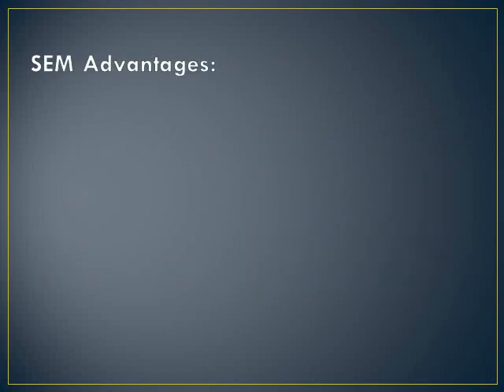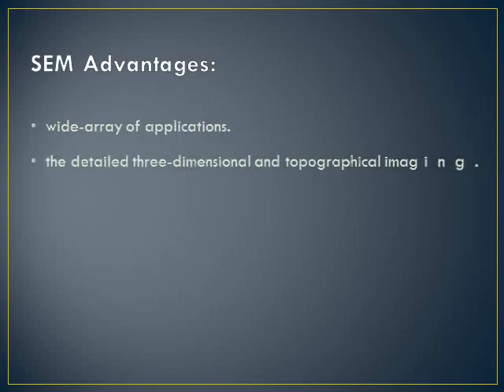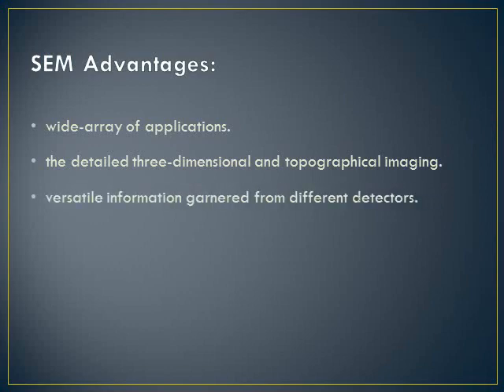In this presentation, I want to mention some of the advantages and disadvantages of SEMs. Advantages of a SEM electron microscope include its wide array of applications, the detailed three-dimensional and topographical imaging, and the versatile information garnered from different detectors. SEMs are also easy to operate with the proper training, and advances in computer technology and associated software make operation user-friendly.